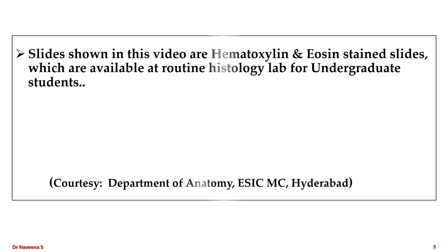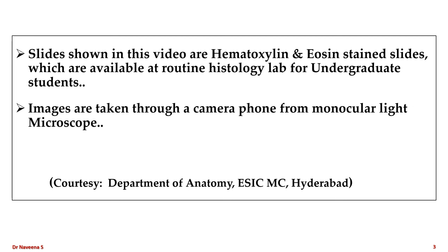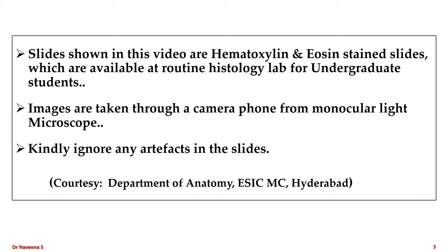A note before we begin: slides shown in this video are hematoxylin and eosin stained slides which are available at routine histology labs for undergraduate students. The images are taken through a camera phone from a monocular light microscope. Kindly ignore any artifacts in the slides.